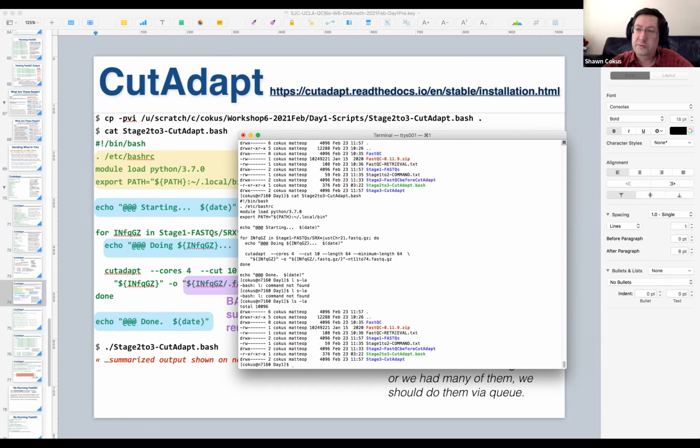Okay, so we've reached time. Day 2, we will start with bisulfite alignment with BSBolt. And then we will go as far as we can go from there with the pileup quantification and eventually the downstream analysis and statistics, and so on. So hopefully this is helpful, and you've been following along, and you've got the slides for reference, and you can play around in Hoffman, and we'll continue tomorrow.